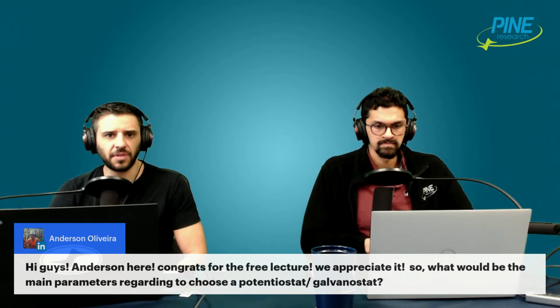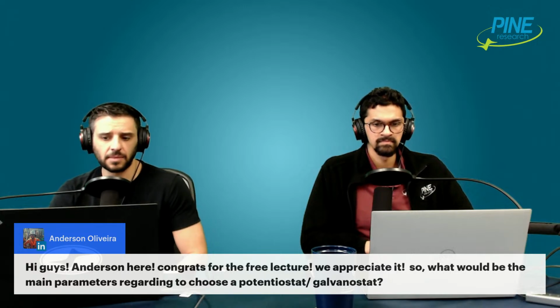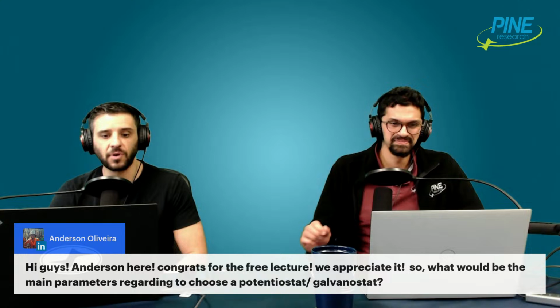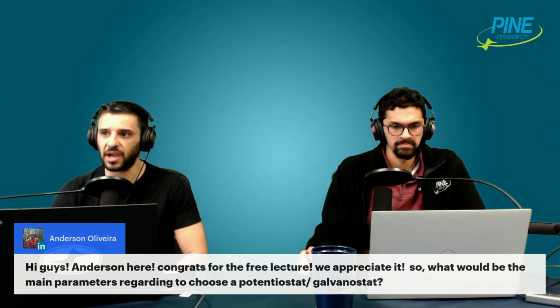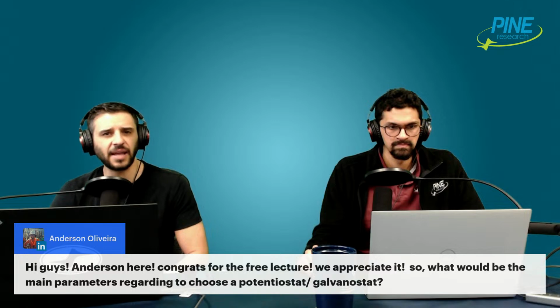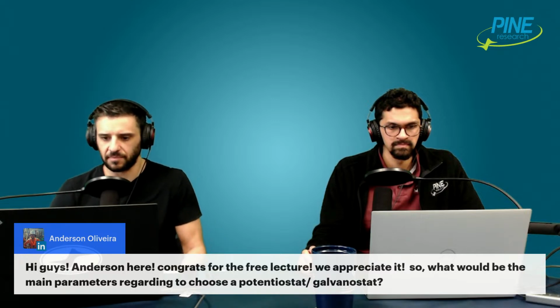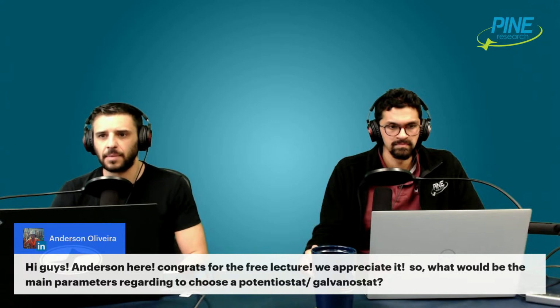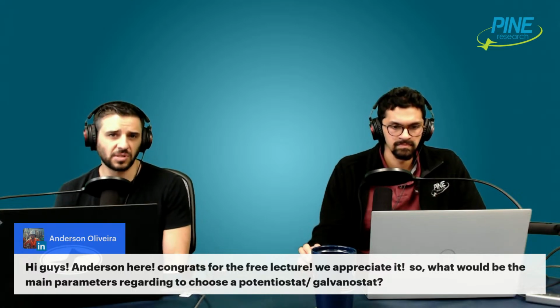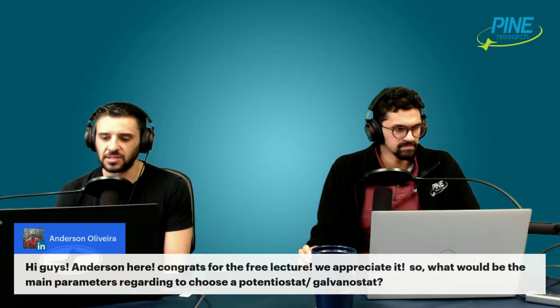And then, there's a lot of other things like the software, and sometimes it's just a preference, of course, but how important is the software? We were just talking about this earlier, actually. It's kind of funny, right? So how important is the software to you? Do you care if the software is user-friendly? Does it just have to be functional and work? It depends on what your mindset is. If you're more of an analytical scientist, you might care more about the software looking and being user-friendly. If you're maybe more engineering minded, you might care less about how it looks and just more that it functions. So it kind of depends on maybe your personality and perhaps your discipline. And so there's some of those kinds of things.